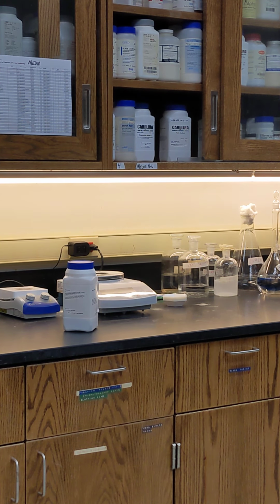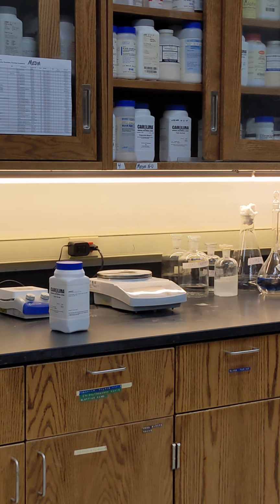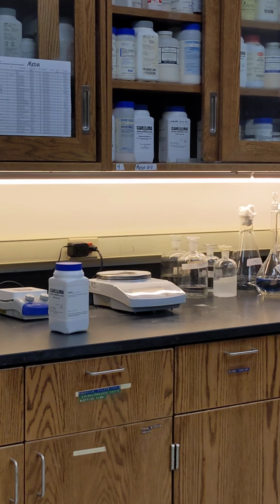So I would go over here, weigh out the correct amount. If I'm doing a half a liter, I do my 20 grams of that media. I would add the corresponding 500 milliliters of water, put them both in a flask and mix them up a little bit. Next, I would take that over to my autoclave. And now I've already got one started, so I can show you the next steps.